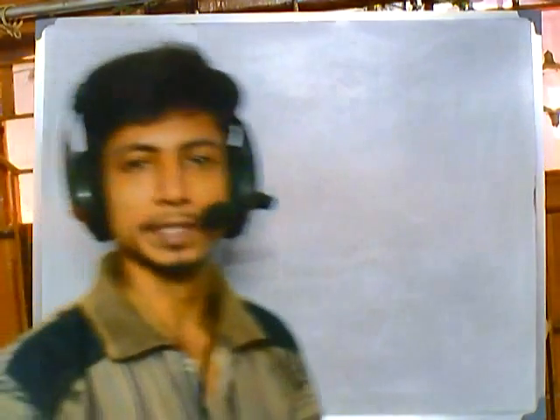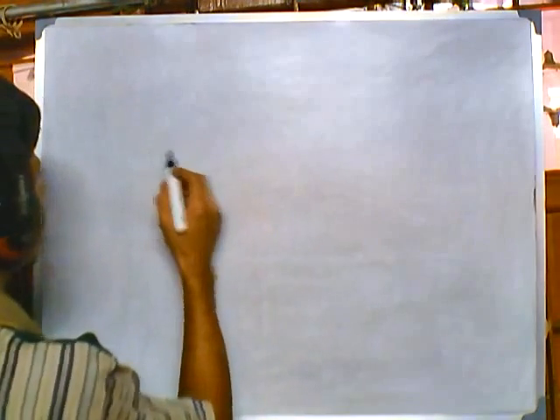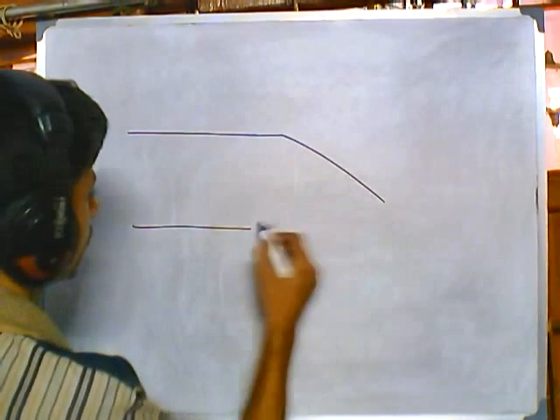Remember, if you remember the model of the mass spec instrument, what we have designed in major three different places of it. One is the source region, then the analyzer, then finally the detector or the computation part. So if we draw the region, we are having this source region. Remember, after the source region we are having the analyzer.